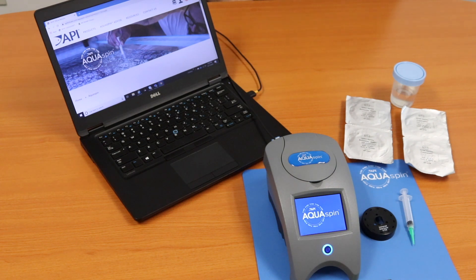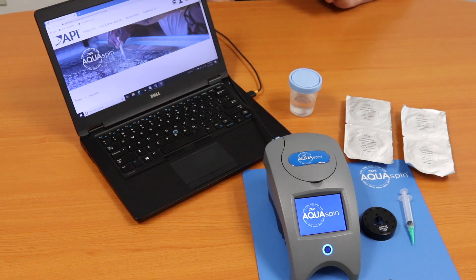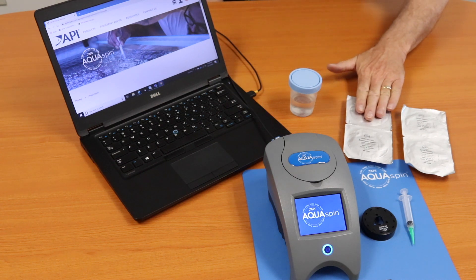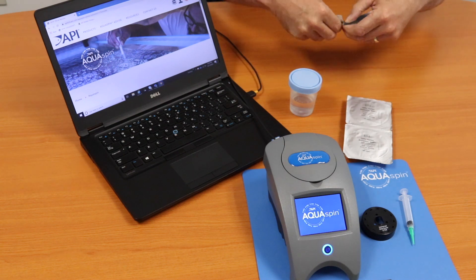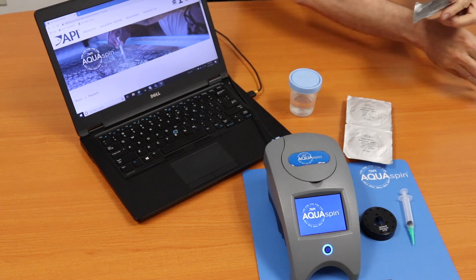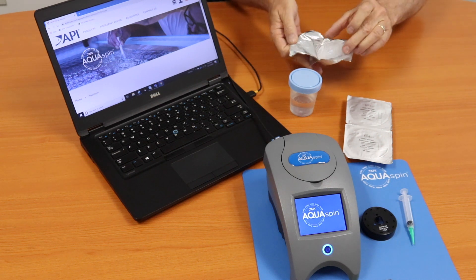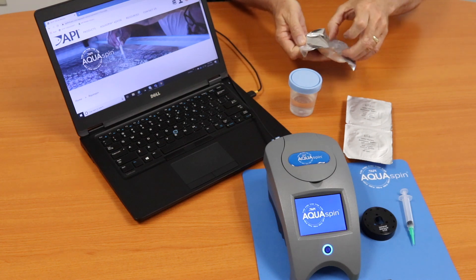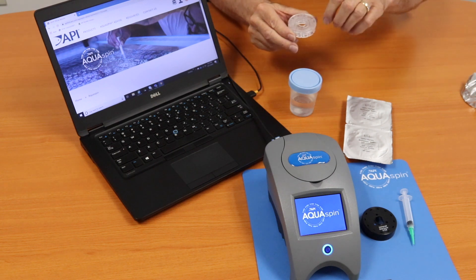Now that you have downloaded the software and created your Aquaspin retailer account, let's go ahead and fill a disk. The customer is going to bring you fresh or salt water — in this case, the customer has brought in fresh water. So we need to select whether it's a salt water disk or a fresh water disk. We're selecting the fresh water disk. When you open a disk, grab it from the edges. We want to keep fingerprints off the top of the disk, because the meter is going to read down through the disk.